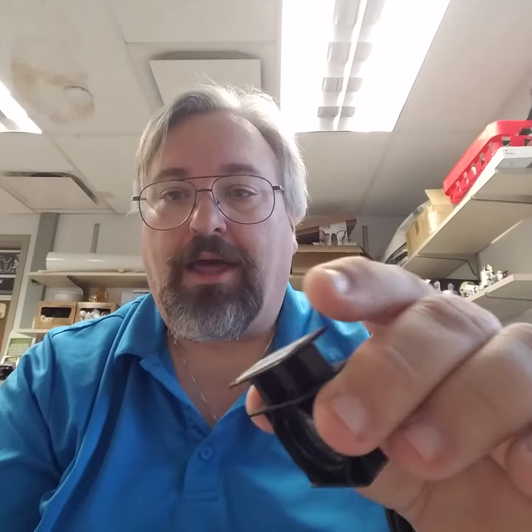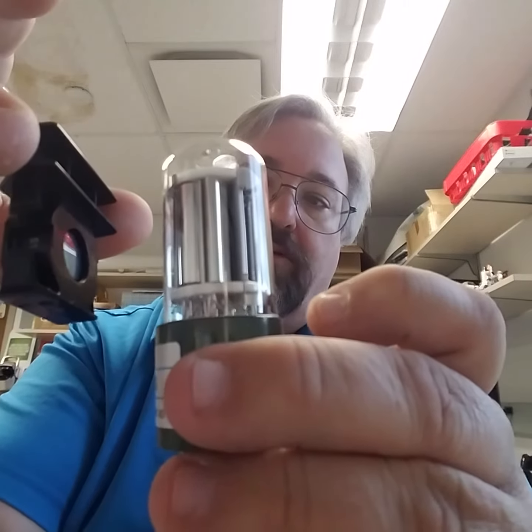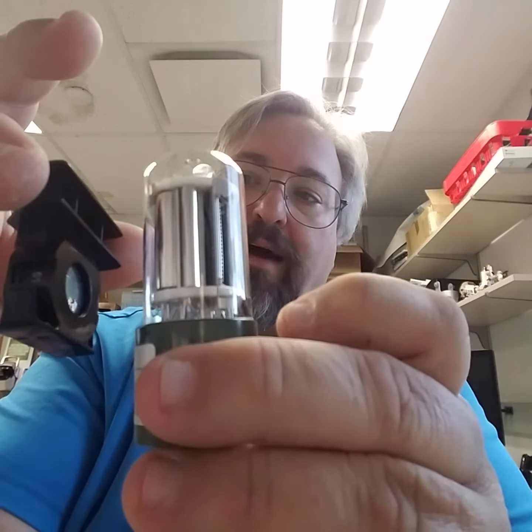This is a bandpass filter, 515/20. So this means light at 515 nanometers plus or minus 10 nanometers will get through this filter. So when this filter is in front of this PMT, only light between 505 nanometers to 525 nanometers will get through. With this filter here, it's a 550/50, so that means light between 525 nanometers to 575 nanometers will get through.